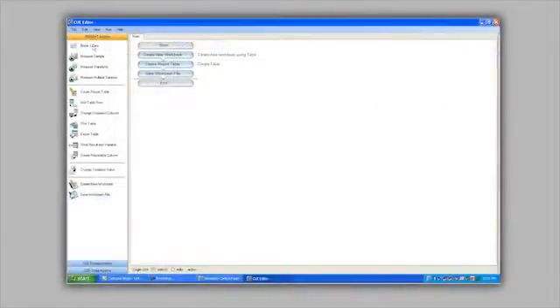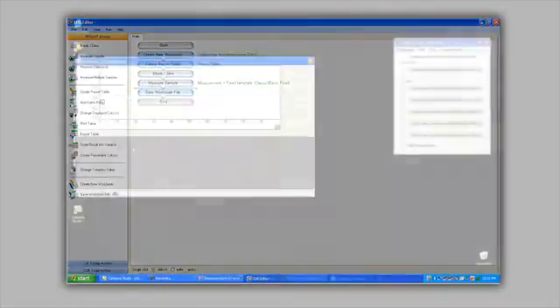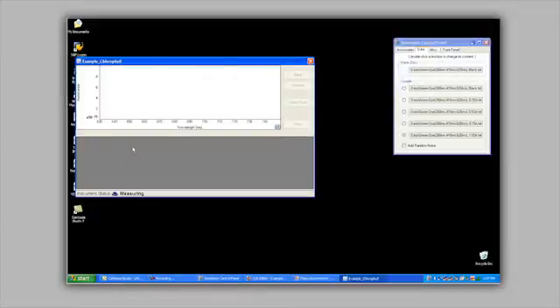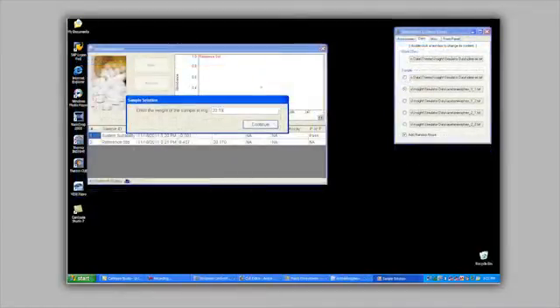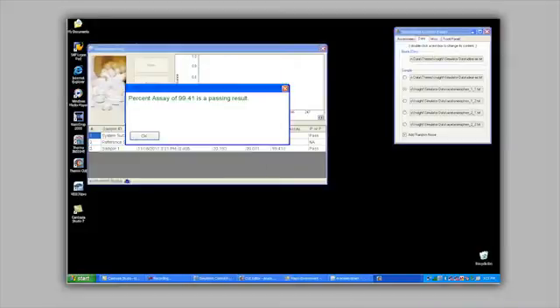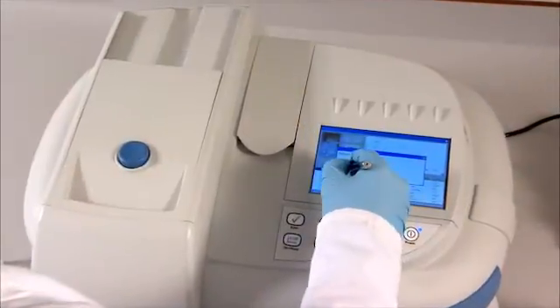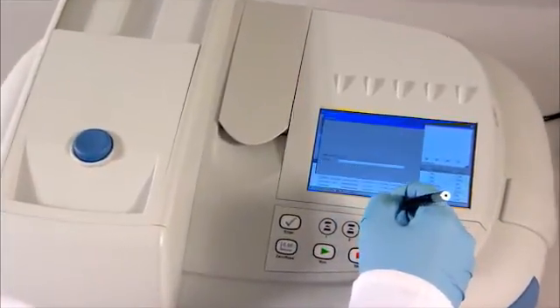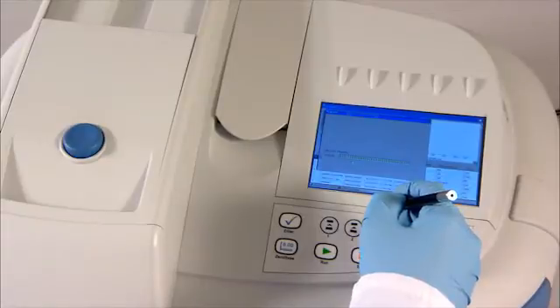For example, a QA/QC lab can customize the Evolution 200 to enforce adherence to defined protocols, perform complex data calculations and analyses, determine pass-fail results based on previously defined criteria, and utilize compatible accessories. That means improved integrity of results, user after user, time after time.